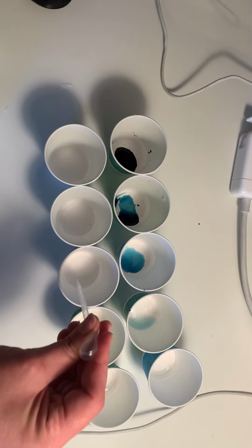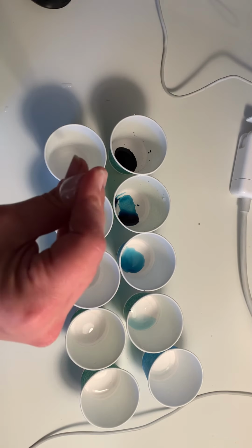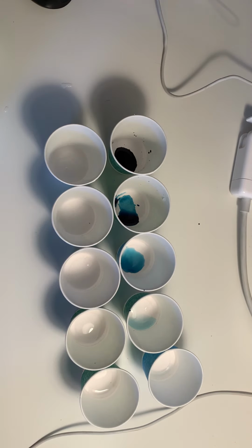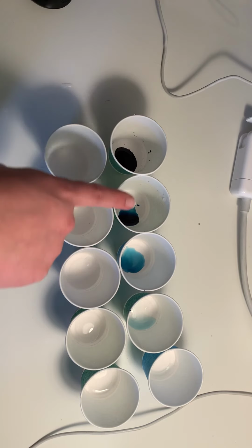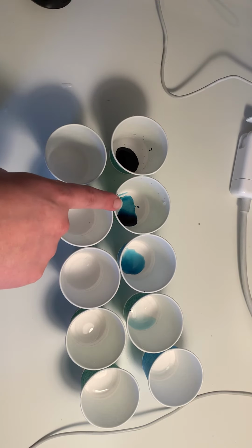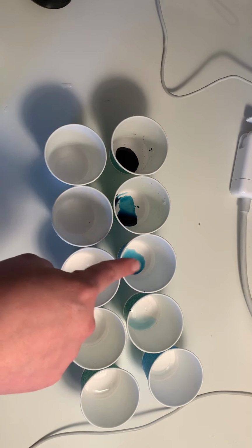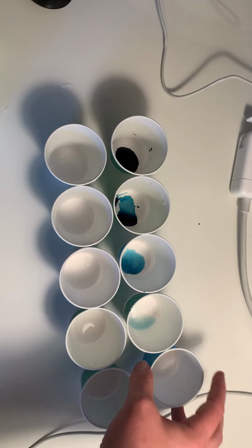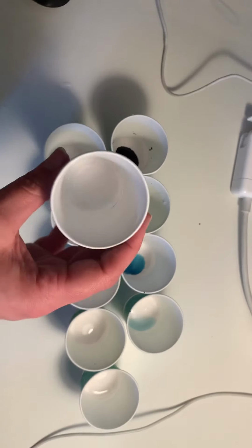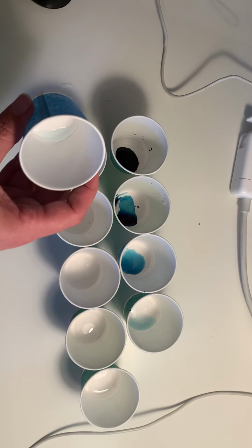We can see how quickly this diluted down. Here we had our 1 million parts per million. We diluted it by 10 and we had 100,000 parts per million, then 10,000 parts per million, 1,000 parts per million, and here we were down to 100 parts per million, where we can still faintly see that coloring.